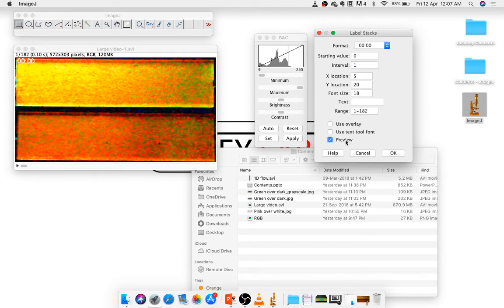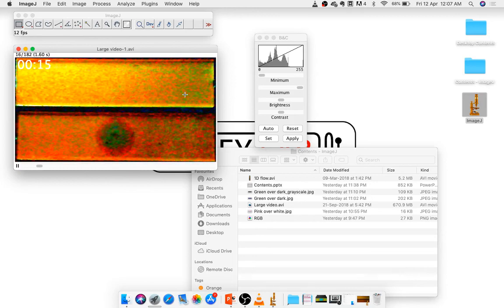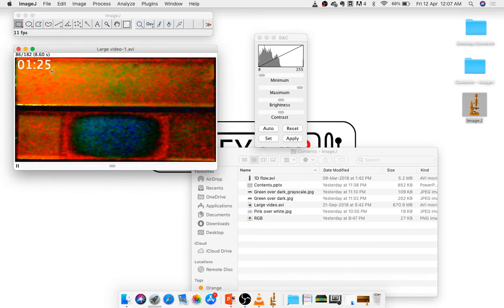So I can do a preview, and it's showing me this thing over here. This is 0 seconds. I usually like my font size to be much larger than that. When you're doing a presentation, it's usually much better. So I can see this timestamp over here, and I say OK. Now if I roll this, this will show me the minutes and seconds of my video. So this is going over seconds. Now remember, in this case, my second number and frame number more or less match, with a difference of 1. But if you had set it to a frame every 2 seconds, it would correspondingly have changed.